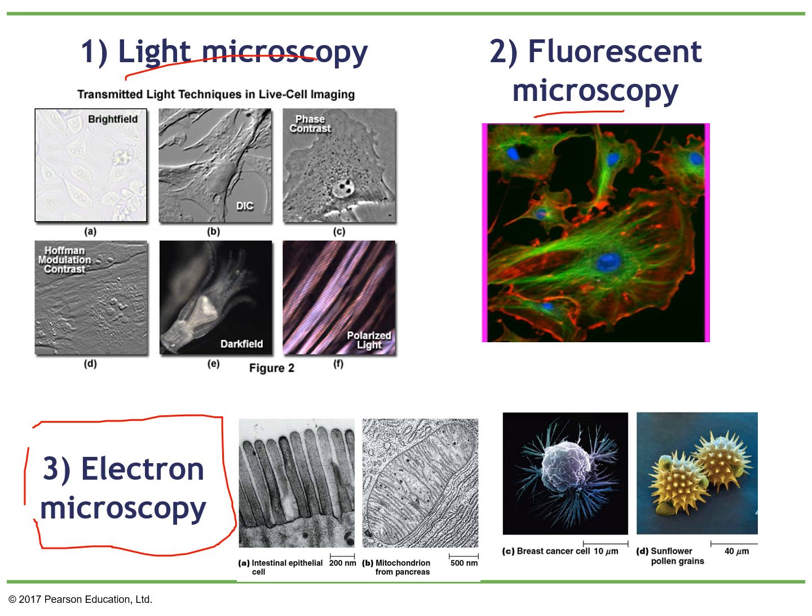I'm going to talk about two types: scanning microscopy and transmission microscopy. This video is going to show you that this type of microscopy has such good resolution that it is not only used in cell biology, but in other fields of science. So let's start with that.